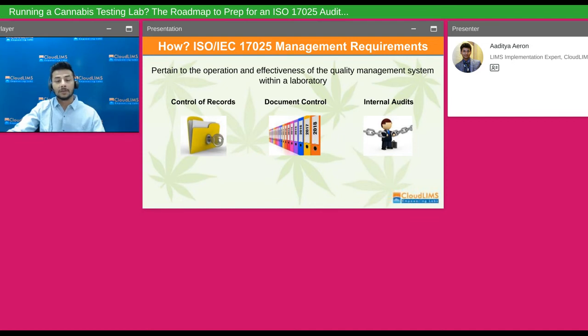And with regards to the test also, let's say the test is entered or rather created by personnel 1, and then maybe the test is conducted by the other personnel, whereas the test is validated by the other person. So at all points, you have a different person controlling the test case. So you need to keep track of all your records and prevent them from any unauthorized access.